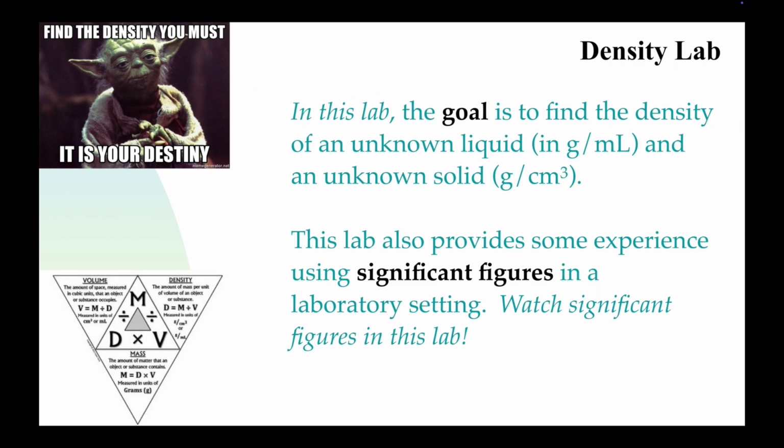It's pretty chill. In addition to learning about density on this lab, this is also a significant figures lab. So make sure you watch your significant figures rules when you're doing calculations. There's both multiplying and dividing, i.e. the actual density calculation part, but there's also some addition and subtraction when you're taking the mass of the flask filled with the metal and water minus the flask with just the water, that kind of stuff. So watch out for those kind of things.